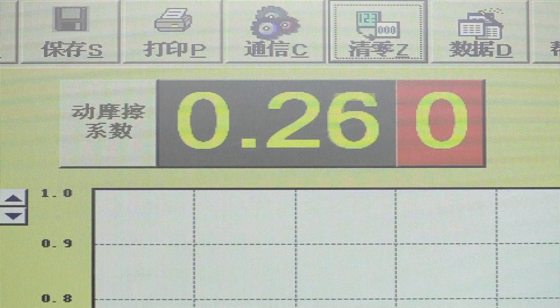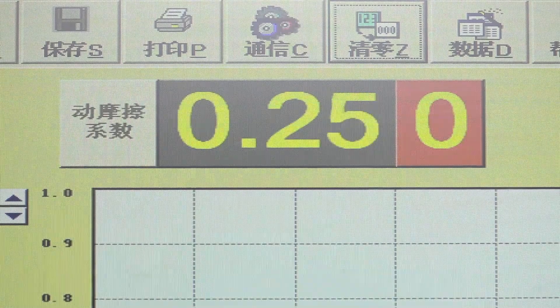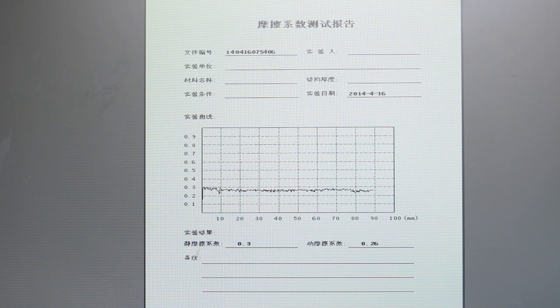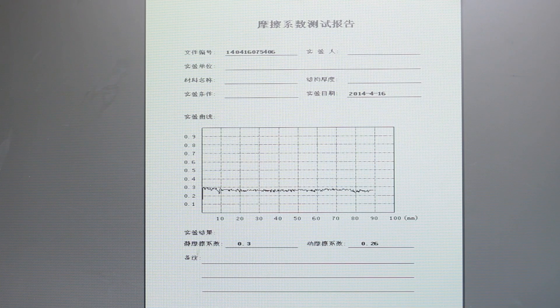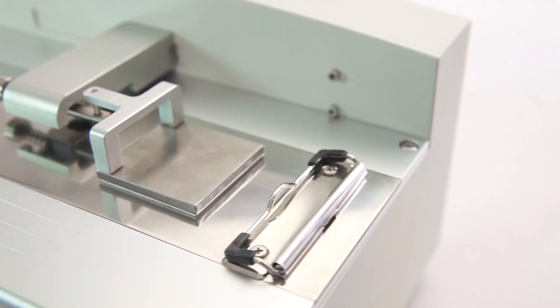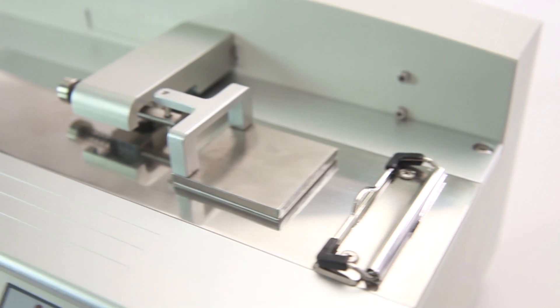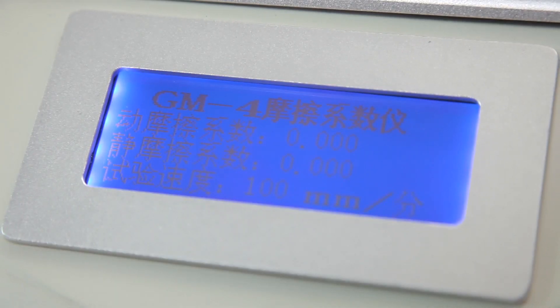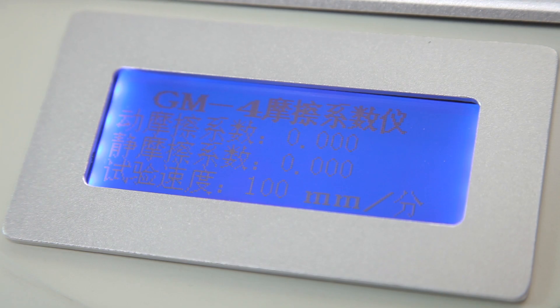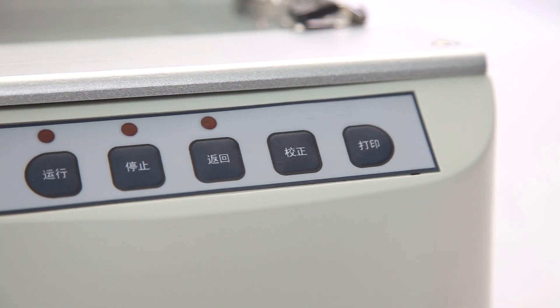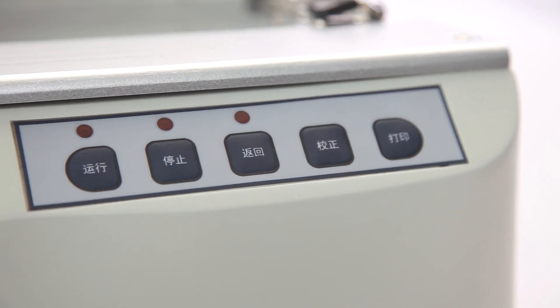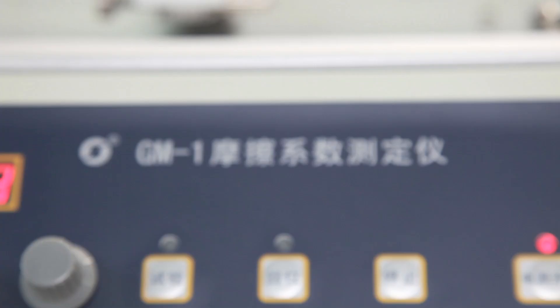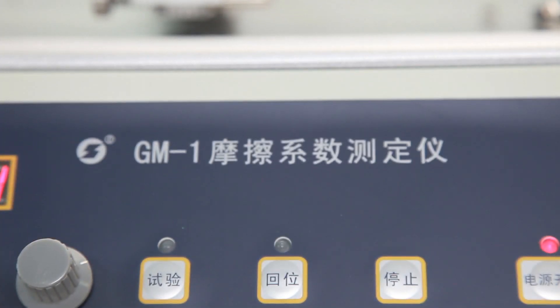Tester range is 0.001 to 0.999. It uses imported high-quality core parts with high precision, high performance and long life, can extend temperature control function. GBPI.